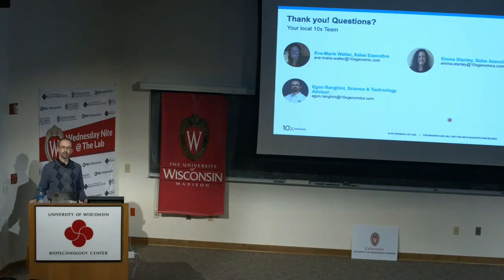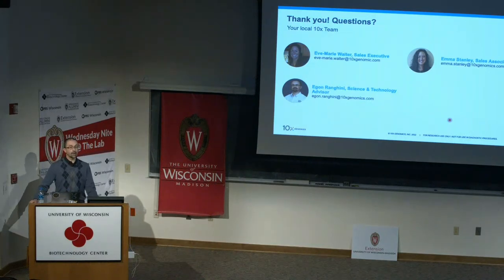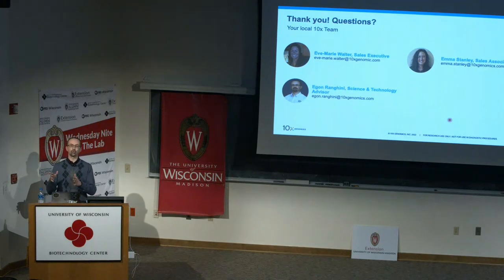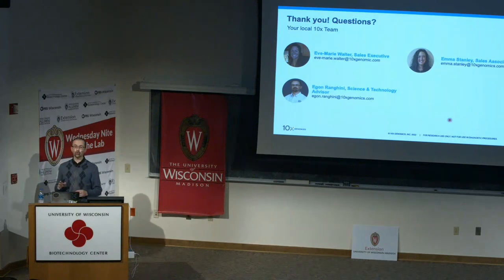Are there any tools in the works to support custom probe design for people? That's a good question. No, there are not, but we're going to release a tech note. Don't ask me when, please. But if it happens before the end of 2022, I'll be extremely happy. Might be 2023 anyway. So we're going to release this tech note in which we're going to provide some guidelines or recommendations on how to spike in custom probes. But in terms of having a tool to design those probes, not that I know of.